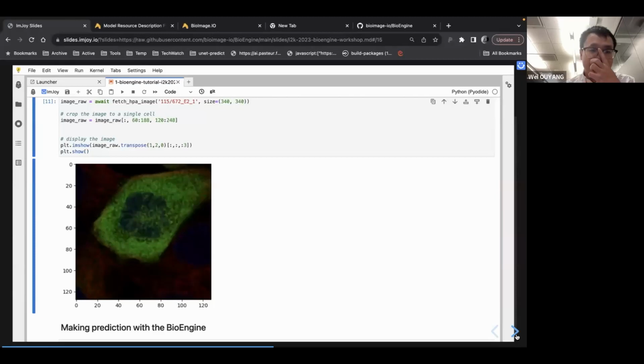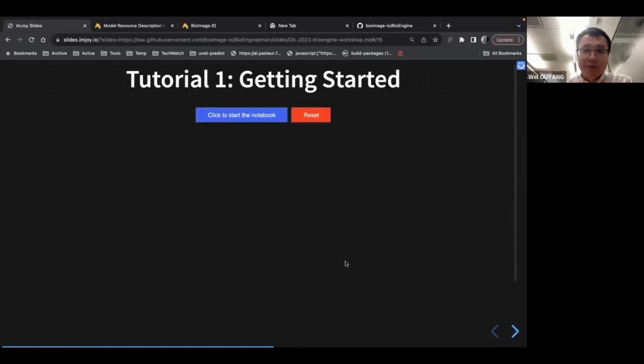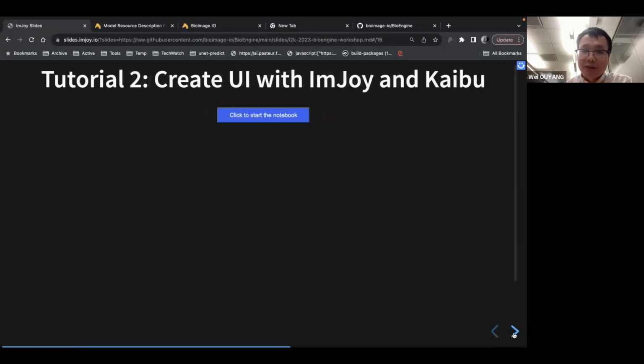Otherwise, I'm gonna move on to the second tutorial, which is gonna show you if you click the link here. If you click this button, you can go to the next one. If you go back, this is the previous tutorial. So I'm gonna show you briefly how you can use this BioEngine.